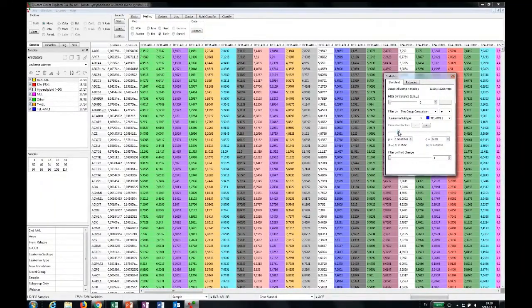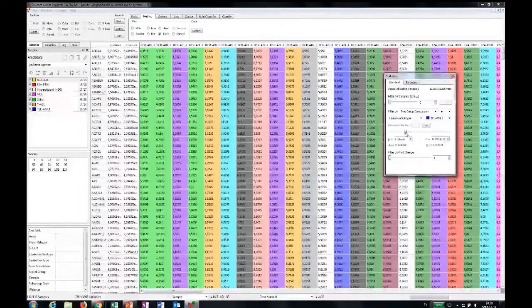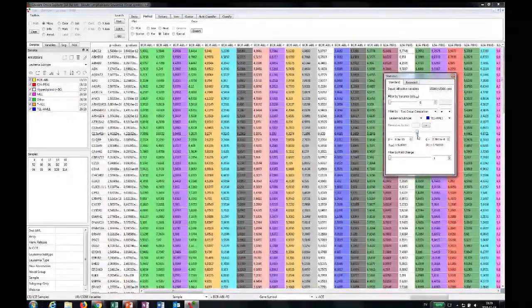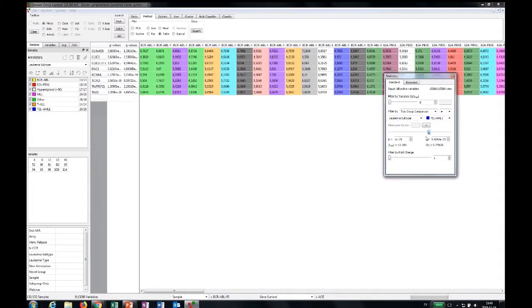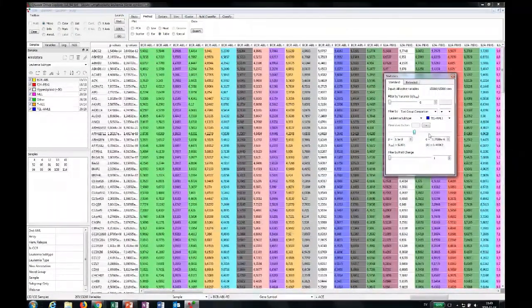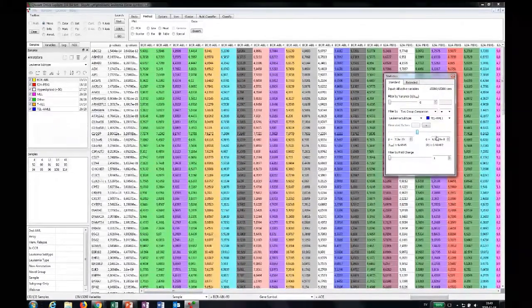And that is a little bit too many, so we would only like to have 100 for our downstream analysis. So we move this slider so that we get 100. If I move too many, you will see that's only one, then 3, 4, 5, 6, 7, 8. So here, that gets us to around 100.